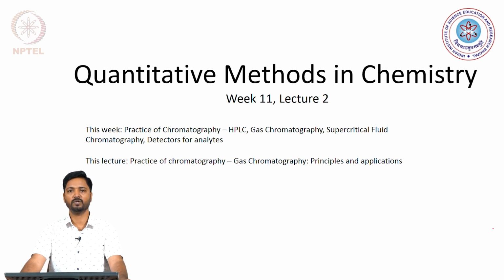Previous lecture of this week talked about high performance liquid chromatography, and this lecture will be mainly dedicated to the practice of gas chromatography. We will be understanding the principles and applications of it, and we will also be contrasting it to high performance liquid chromatography to understand what are the key differences between these two techniques and for which kind of systems will gas chromatography be applied.